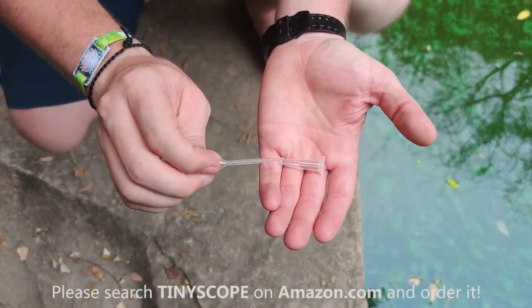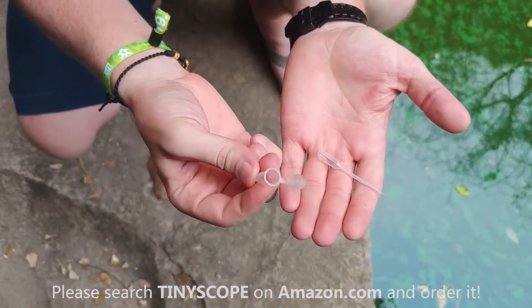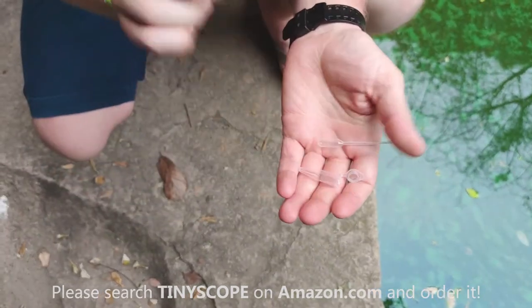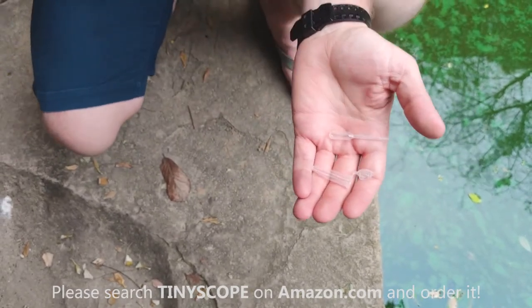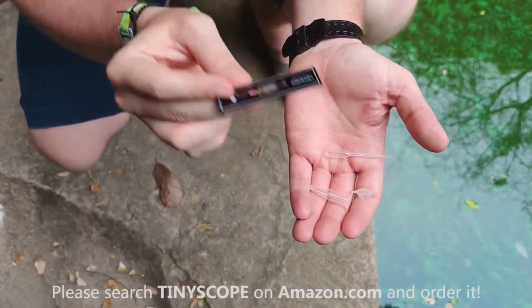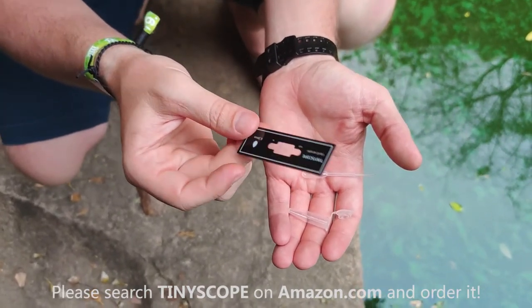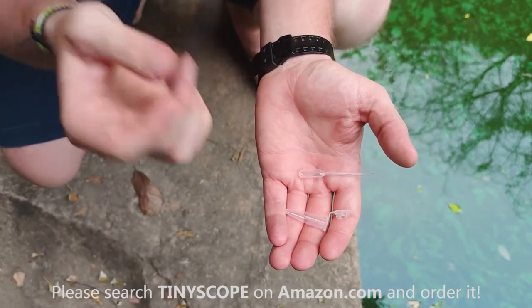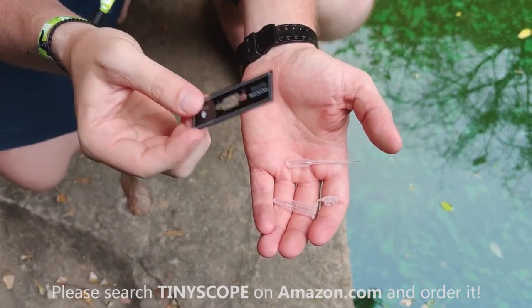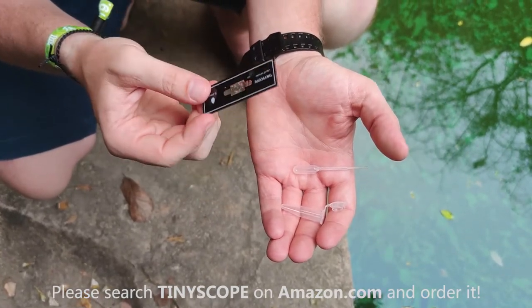In my hand here I've got the pipette, our little eyedropper, and we've also got the water sample holder — a little bottle to hold your water sample in. These are both washable and reusable. The slide, however, is not really reusable — once you get a water sample in there it's very difficult to clean out. Additional slides are available in our store in different sizes, depending on what you want to be viewing.